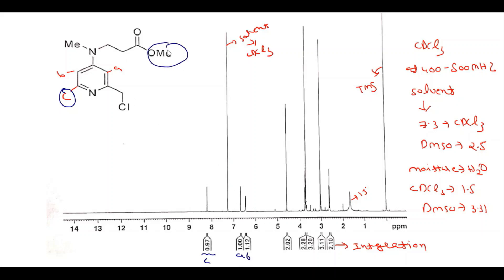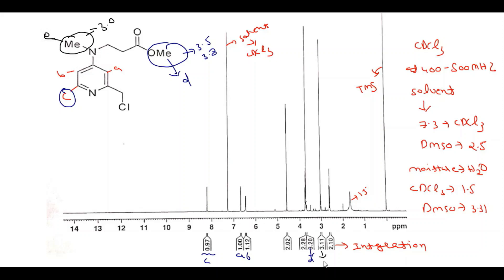Now let us look at the methoxy proton. I already told you this value will be approximately 3.5 to 3.8. So looking at 3.5 to 3.8 — three protons. These three protons I have labeled as proton D. So this is our methoxy proton D. Now let's look at other protons like the N-methyl proton. I already mentioned these three protons will be approximately 3, which we calculated. So these are the three protons of the N-methyl group, labeled as proton E.